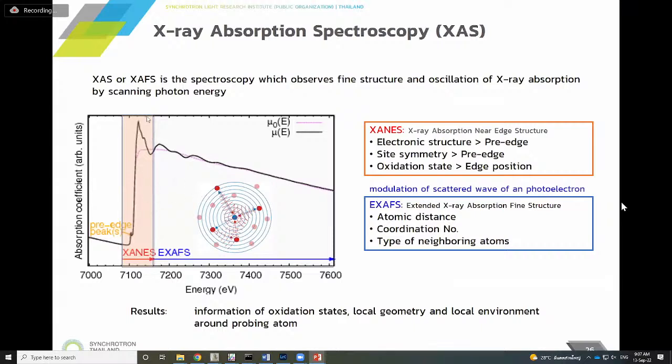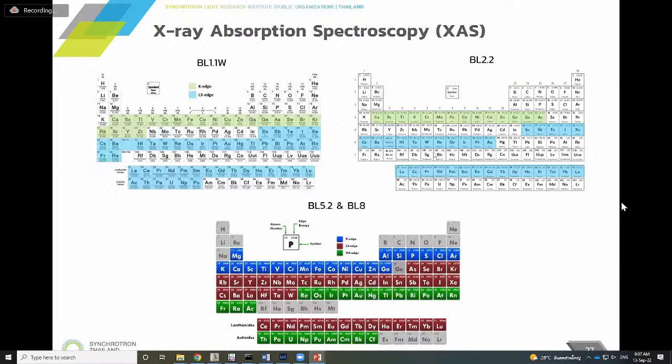By these both, they tell you the elements and what is around. The EXAFS region tells you the scattering pattern, forth and back. So by interpreting this pattern, you get the bond length and bond angles, the atomic structure of the sample around the edge.